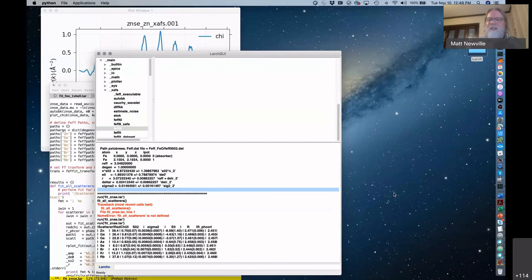I'm not sure that we fully understand all that, but it seems like there's things in those maps that are giving you hints that there are other things happening than just single shells overlapping in one another, but where they're actually doing interferences, which are hard to see in either just K or just R space. But in the wavelet space, you can kind of see those things happening.